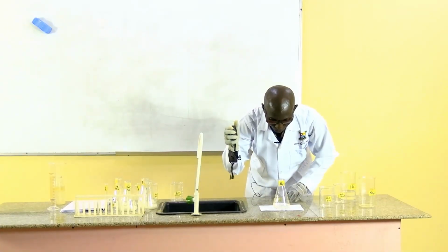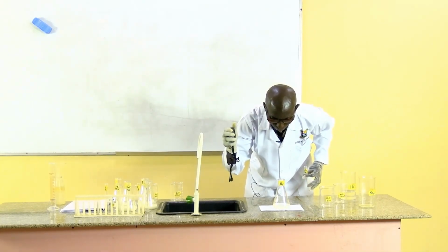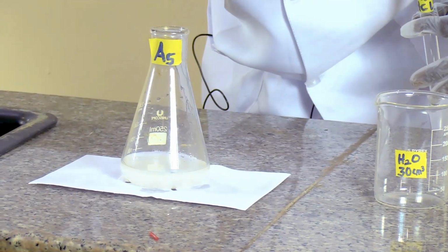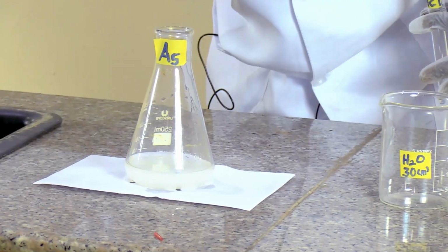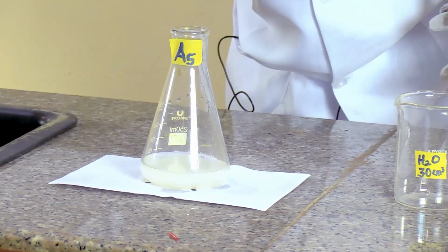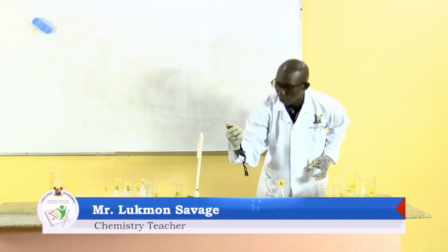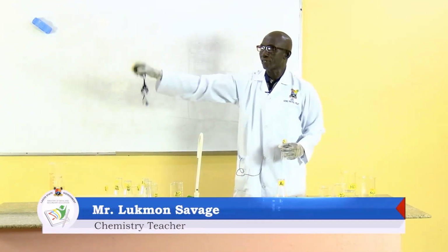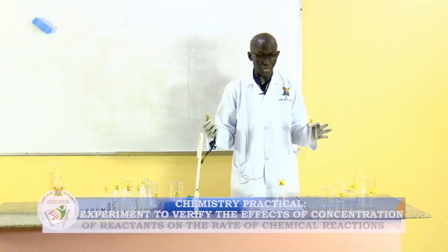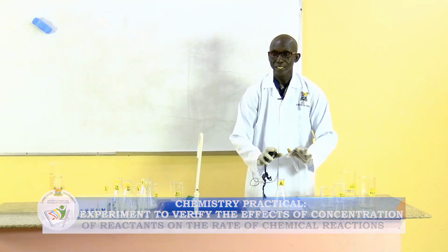The cross, the black cross is gradually disappearing. It is disappearing, but I can still see it. It is gradually disappearing. It has not disappeared completely. Stop. I have 25 seconds there. 25 seconds. With this, we have come to the end of the practical session.